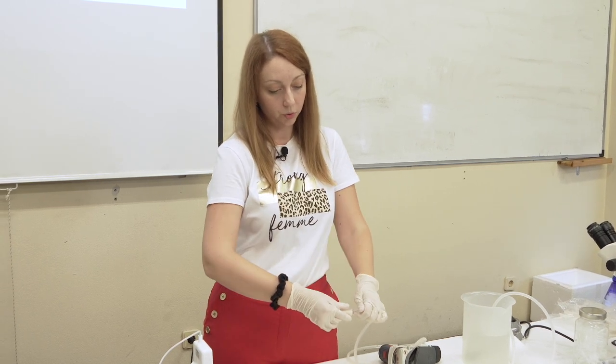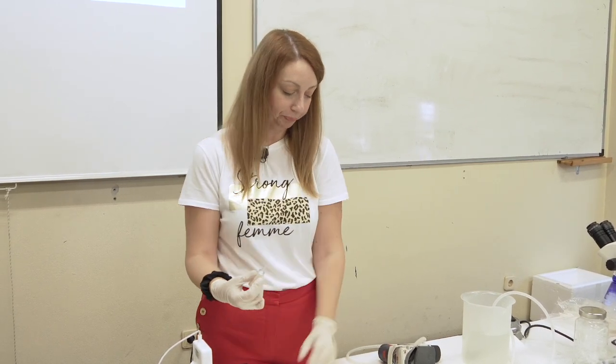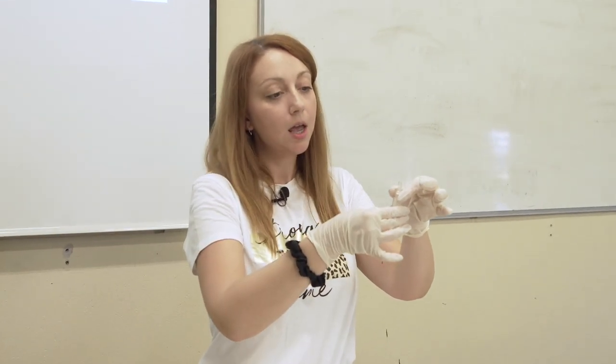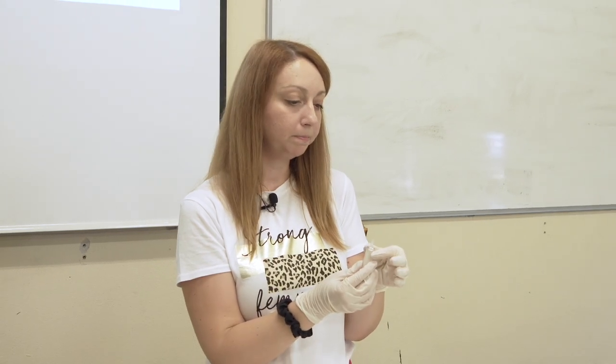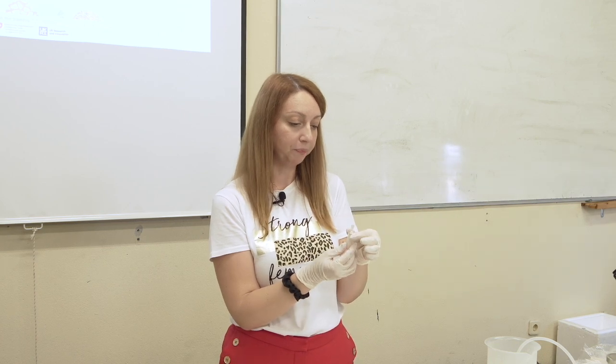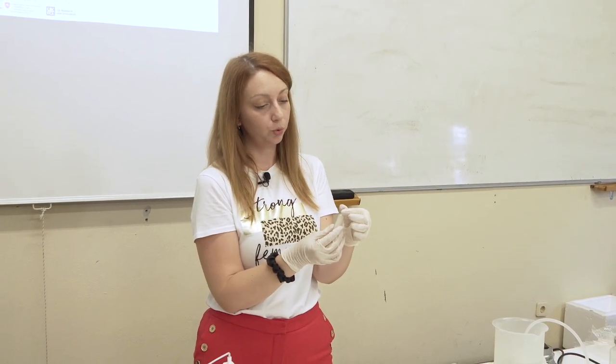The next step is just to take all of the water volume from the filter, and then you preserve as you want. If you want to keep it a long time and do the next steps after a long time, you can add a preservation buffer inside it, or otherwise you can keep it in the freezer and let it thaw so as to proceed with the DNA extraction.